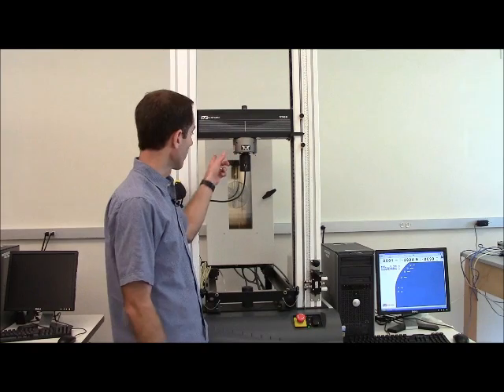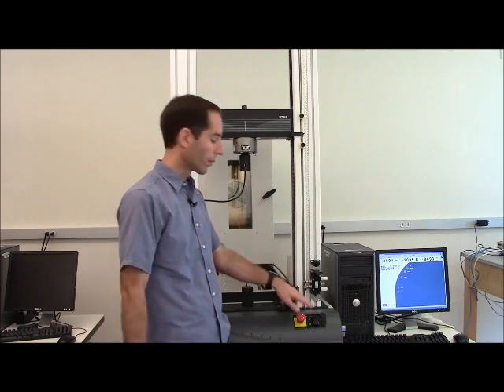With the grips removed, the machine on, and the Blue Hill software loaded, I can now raise the crossmember up above the temperature chamber that's behind. I need to have that high enough such that it clears when I roll the oven forward.